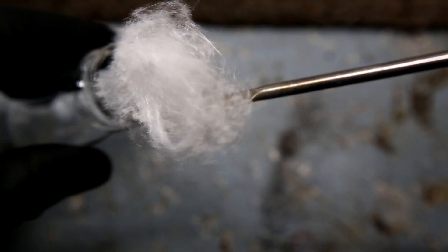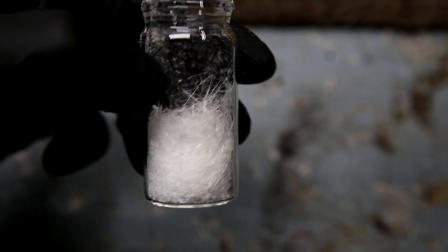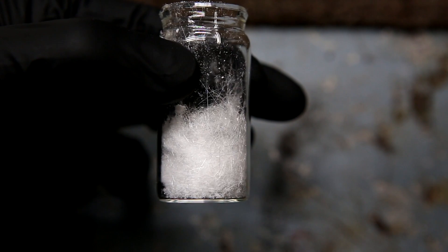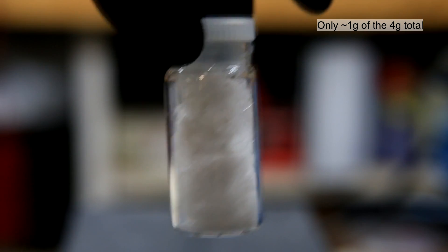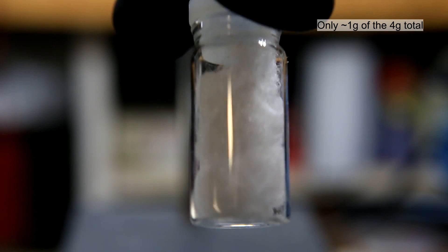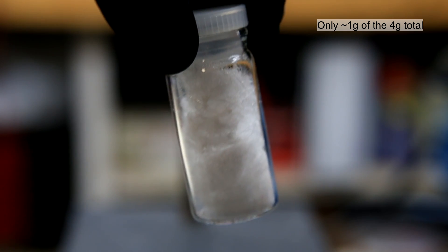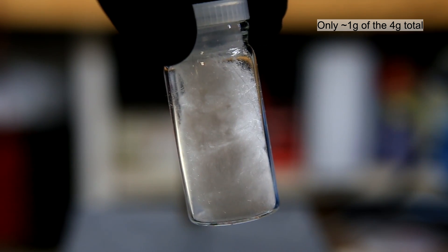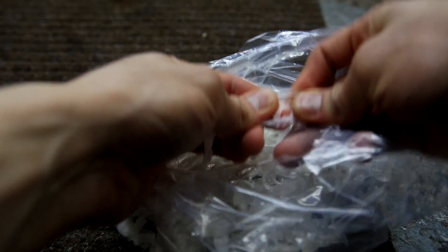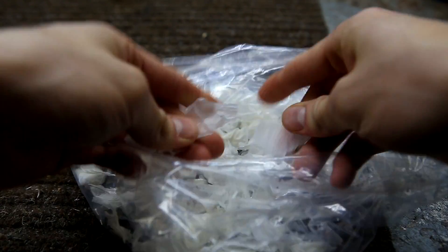The nearly pure phthalic anhydride crystals are then placed inside a dram vial. This process is repeated several times until no more phthalic anhydride sublimes off. The final yield was nearly 4 grams of pure phthalic anhydride — shown here is only about 1 gram of the total. The crystals are very fluffy and it looks like a lot more than it really is. This also shows how brittle the gloves become after the plasticizer is removed — stretching and tearing forces cause the pieces to break apart quite easily.